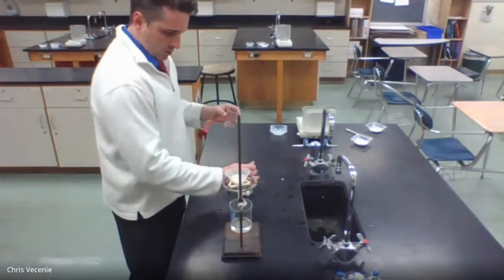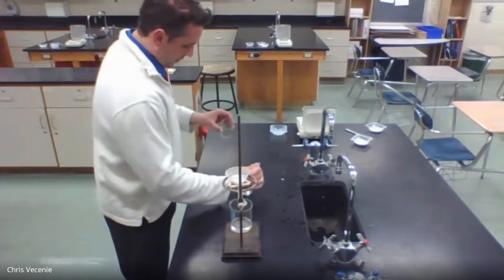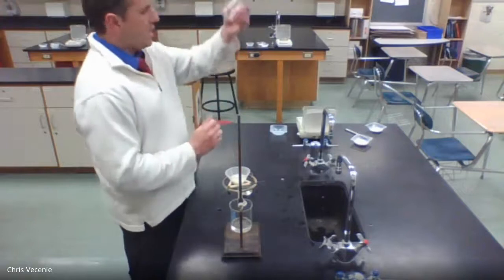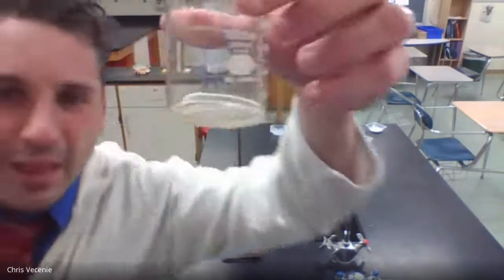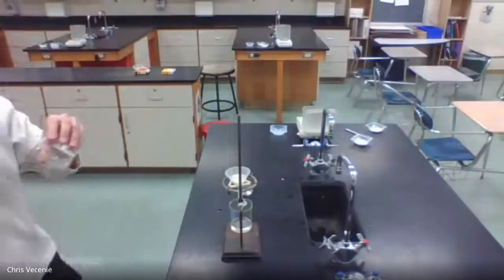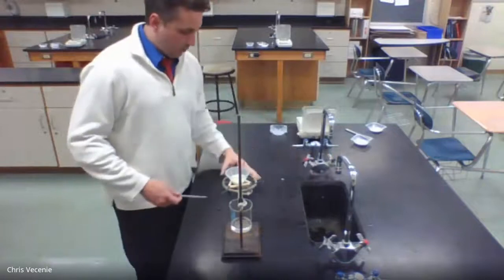Right? And you would just do that once or twice. And if when you use your pipette to try to rinse down the sides, you look, and it's still pretty clear and colorless, right? That means you've gathered all the solid that you're going to be able to get.